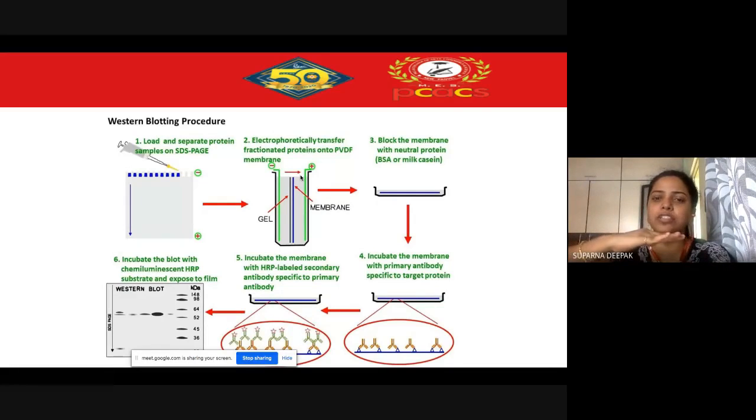The horizontal chamber which we have in our college is useful when you want to combine ionic transfer as well as capillary transfer together. In vertical chambers, it is mostly only ionic transfer that takes place.